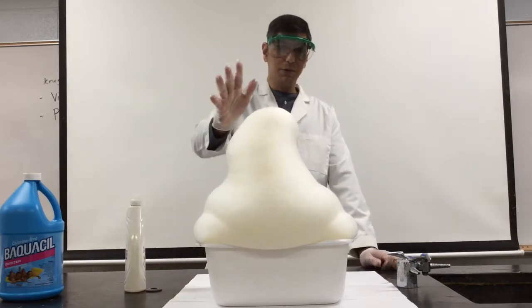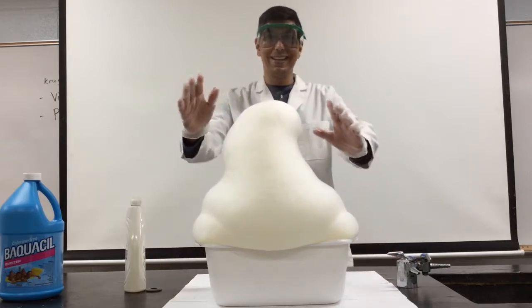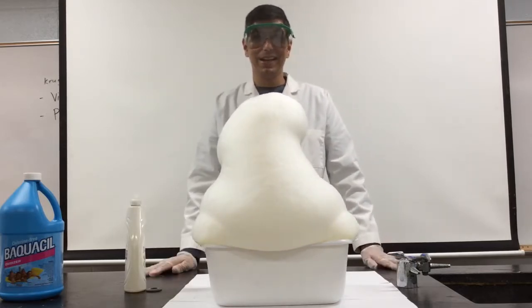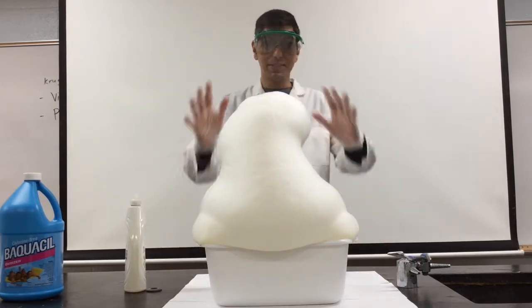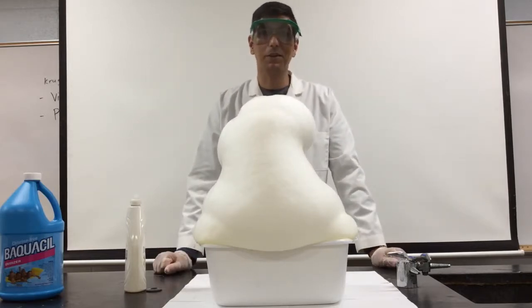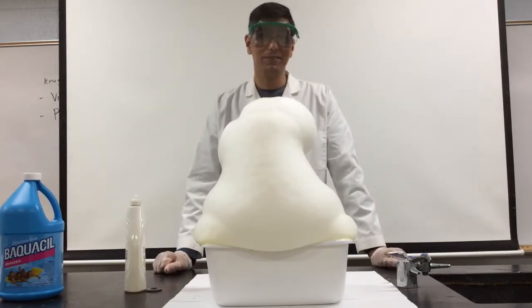This is getting pretty hot. I even see some steam here. So this is a pretty exothermic reaction.